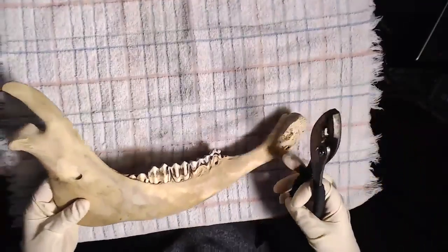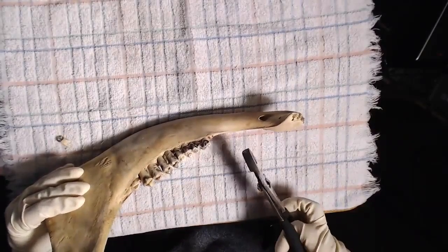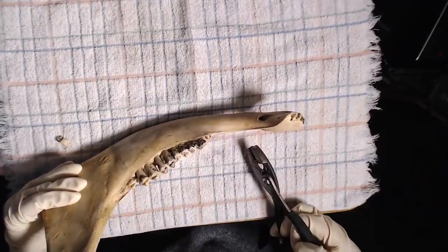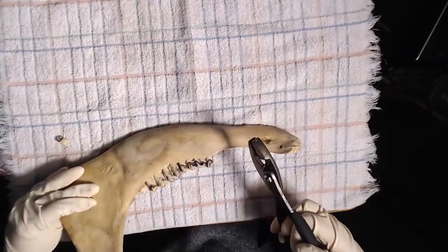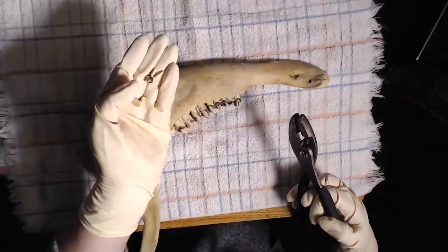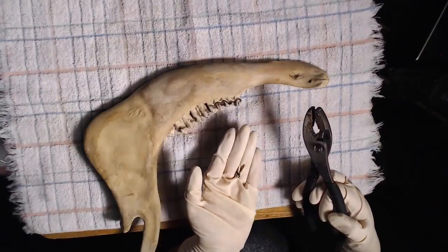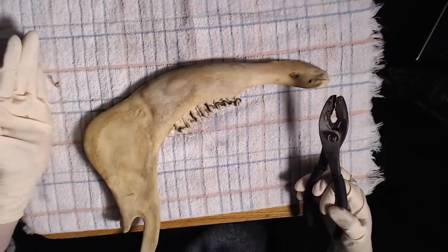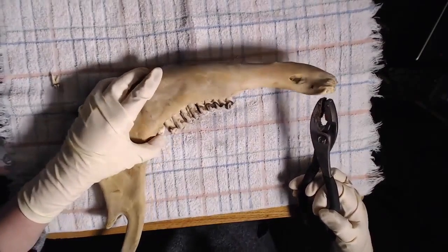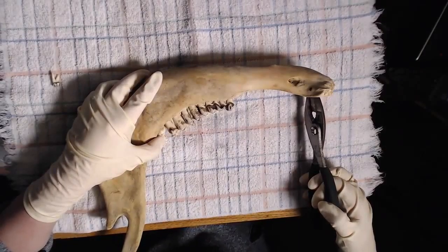Now I already did this, so what I did was I took one of the front premolars, because those seem to be easier to remove. I took the very first one, and here is that right here in my glove. You can see how small that is compared to some of the other molars. So I would recommend picking one of these premolars in the front to try to take out of the cow jaw.